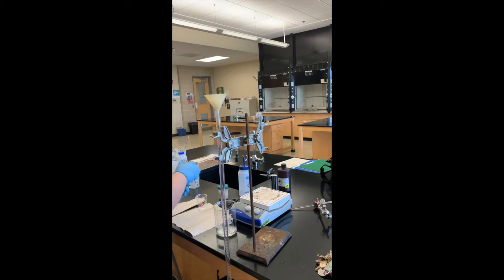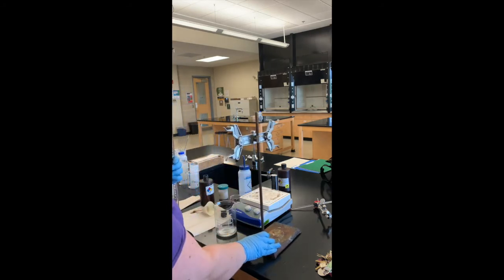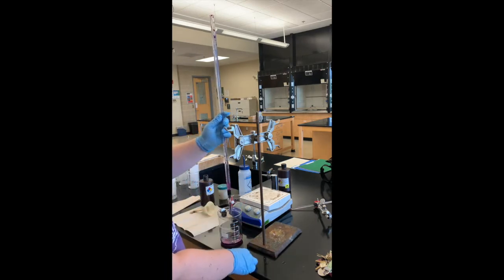When cleaning, it doesn't need to be a lot — between five to ten milliliters — because whatever you pour out of the brown bottle has to go into the waste container, so be mindful of how much you're using. Always remember to check the stopcock as well so solution doesn't come out of the burette unexpectedly. You'll notice the potassium permanganate is a bright purple color. These washes also go through the tip of the burette, and we do this five times.